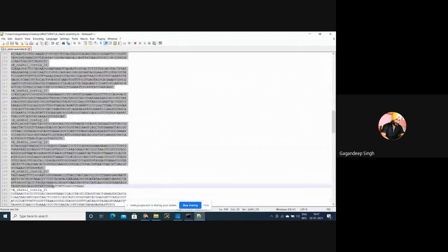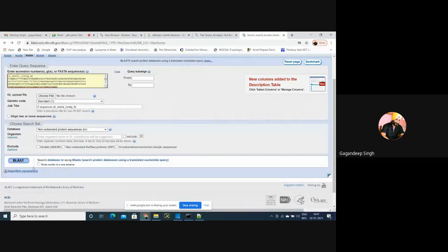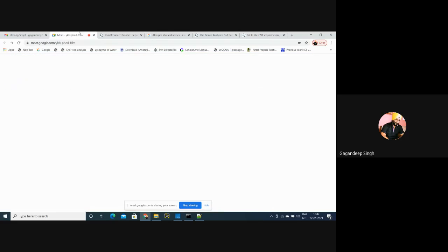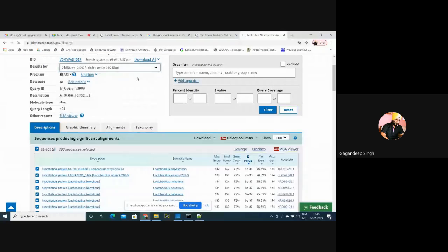Next 5 or 10. I'll select 10. Whenever we get the targeted gene from this particular data, our next step will be to identify its expression analysis or pathway regulation, meaning which particular pathway our transcript is controlling. Okay, all are hypothetical proteins till date. Let me see it again.